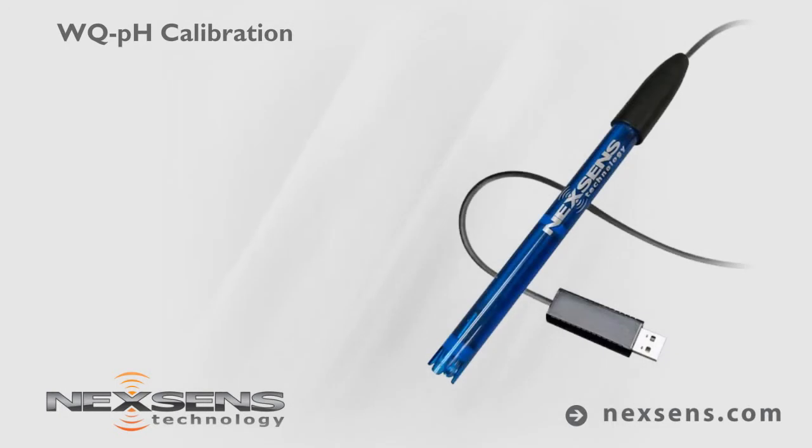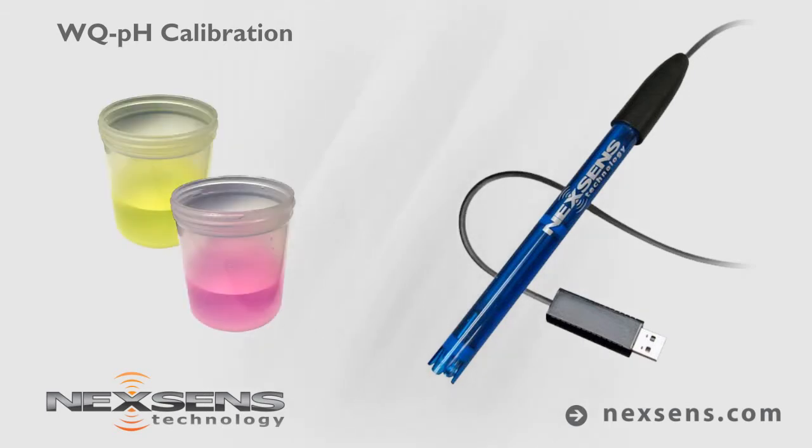Calibration and measurements with the NexSense WQPH sensor are quick, easy, and reliable. The software supports a one, two, or three point calibration.